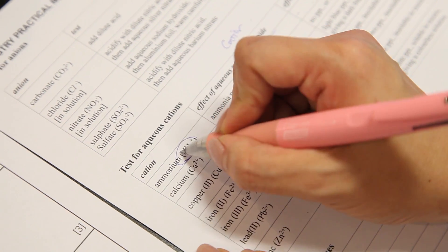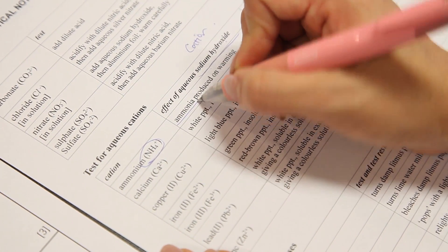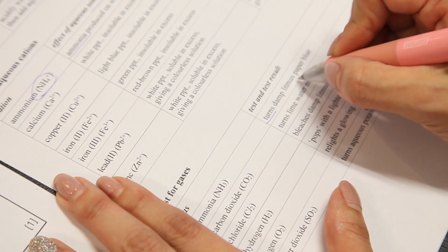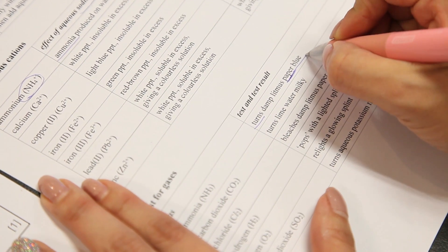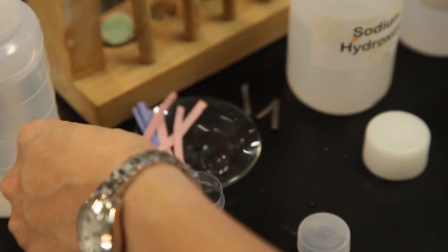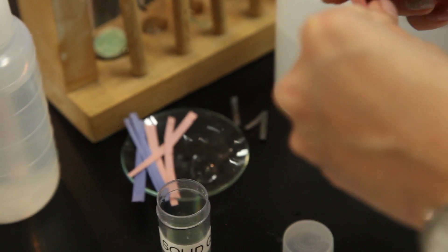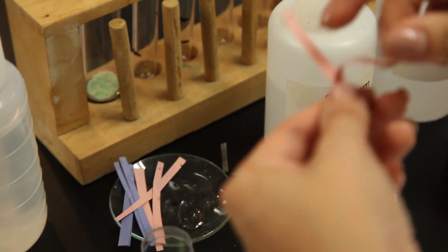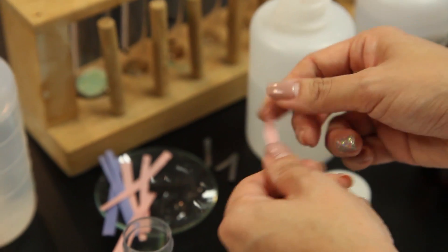This is the test for ammonium. Ammonia gas will be evolved. Ammonia gas will turn damp litmus paper blue. So I need to prepare red litmus paper. Then the red litmus paper. Let me place it over here.